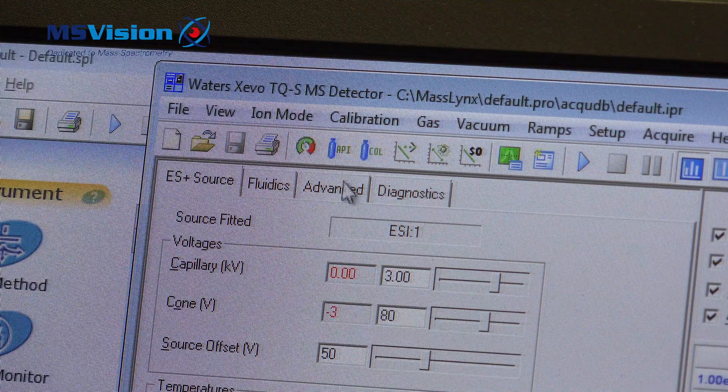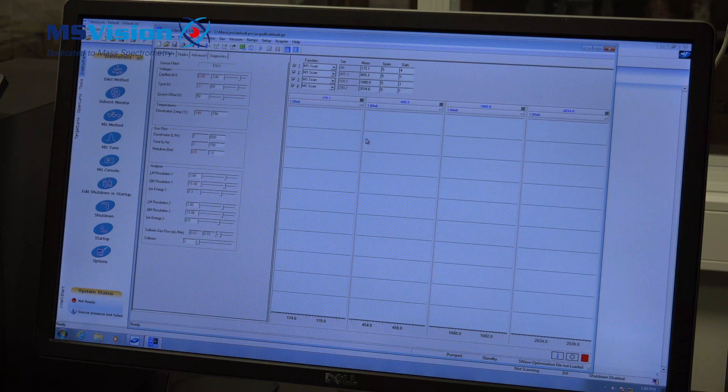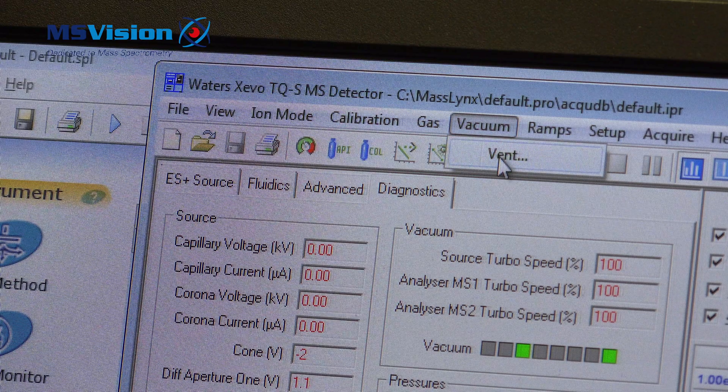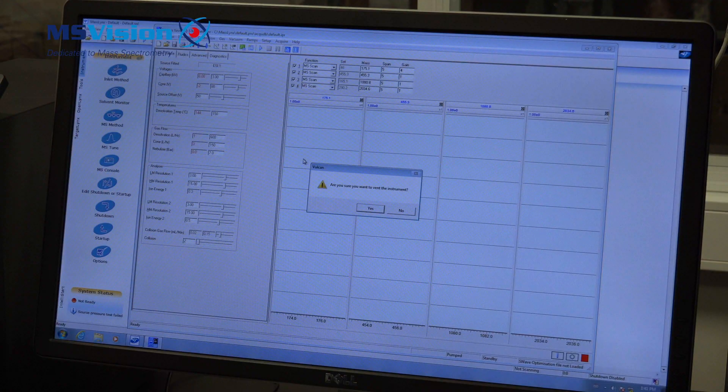Now I'm going to vent the instrument. Select vacuum, then vent. It will ask you if you're really sure, because you should be sure to vent the instrument as it will take time.